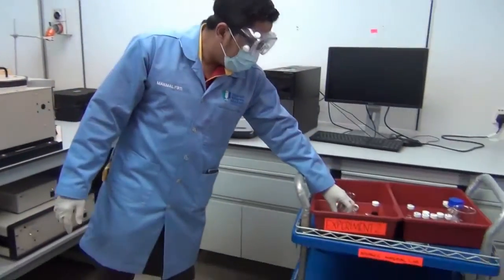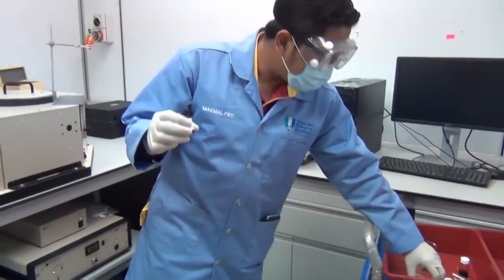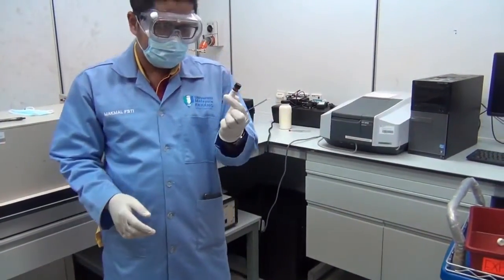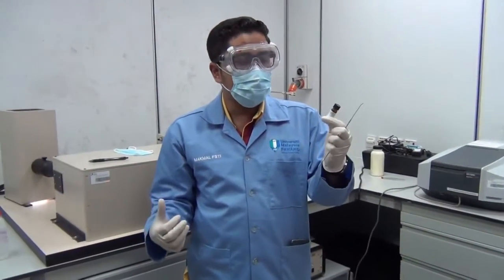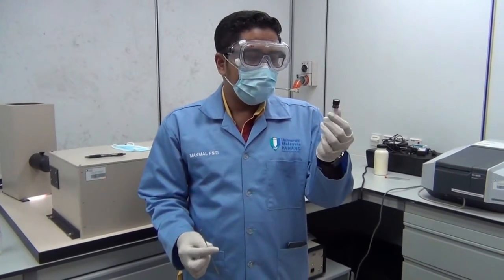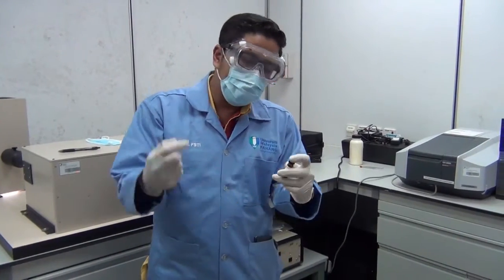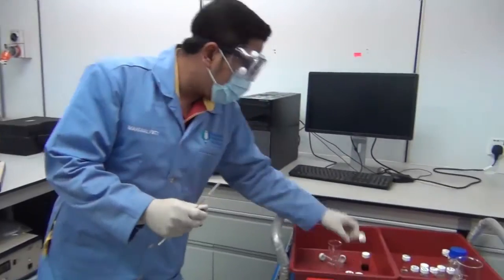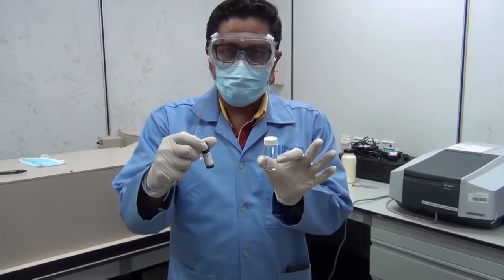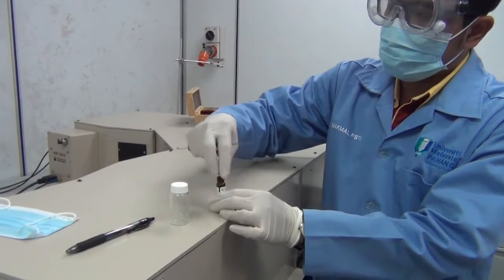Now, you will be given 1 sample of organic dye. So the dye is in powder form. Unfortunately, for our machine, if we are going to use powder, we need a lot of powder. So to minimize the usage of the powder, we just need to take a small amount of powder and put it in a blank vial, a very small amount, and dilute it using ethanol. Now, how much powder do we need? Very small amount.